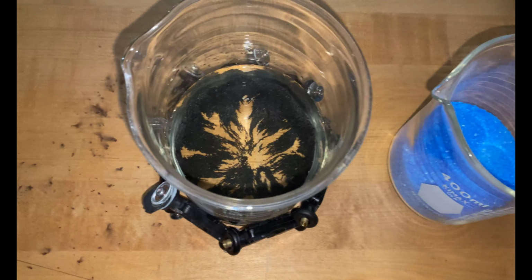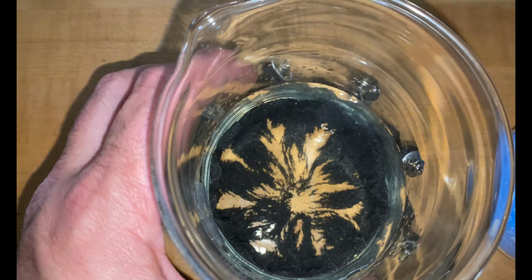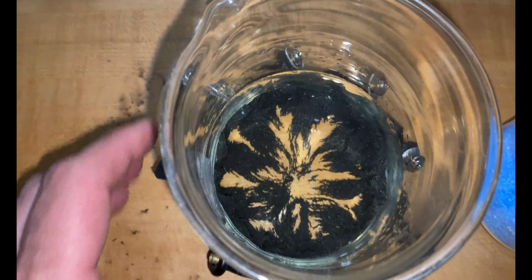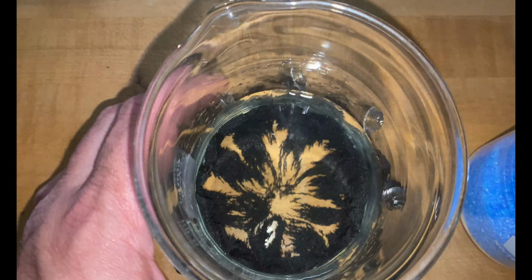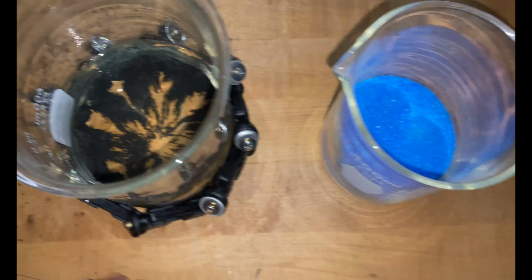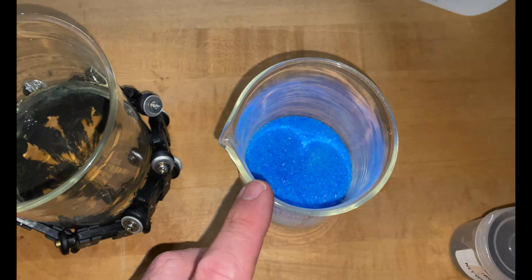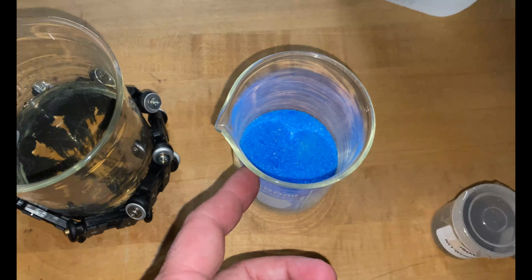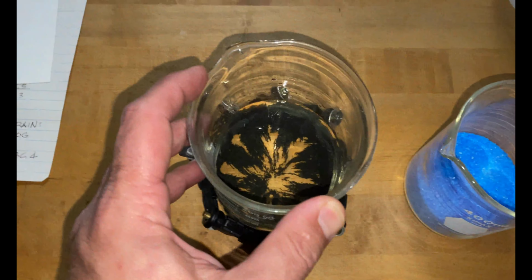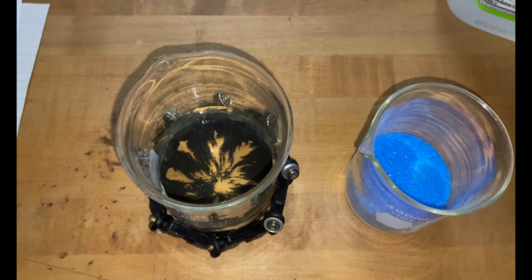So here's the magnetic field. It's influencing the iron filings. We've got a bit of a cool pattern going there, and I kind of stirred it around and got it fairly well evenly distributed. Here's the copper sulfate. I'm going to add water to the copper sulfate and try to get it to dissolve before pouring it into this magnetic iron matrix, and we'll go from there.